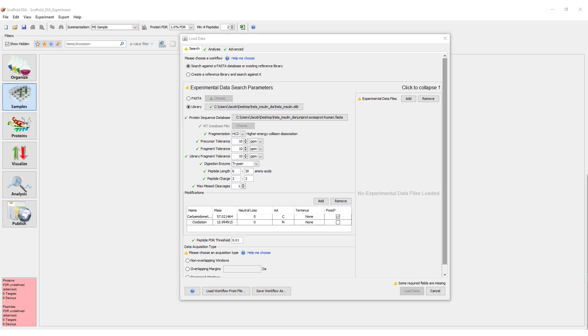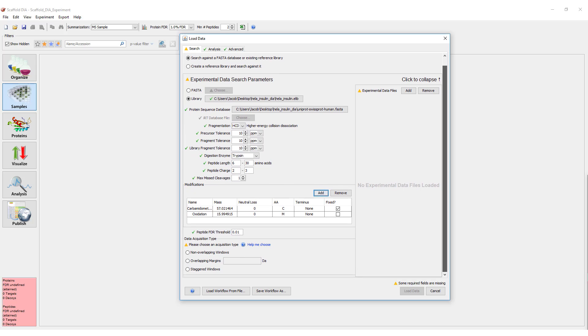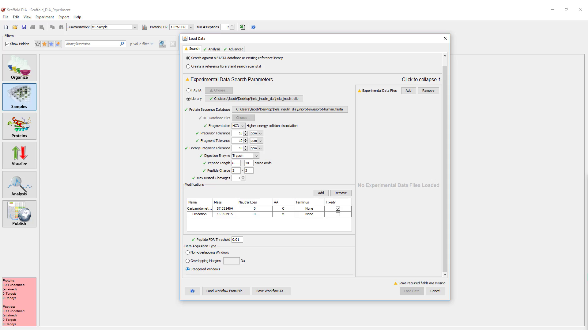The final parameter, and one that might be unfamiliar to people, is the Data Acquisition Type parameter. This tells the program whether your DIA windows were non-overlapping, overlapping with small margins, or staggered with significant overlap. Make sure to set this appropriately based on your instrument settings.